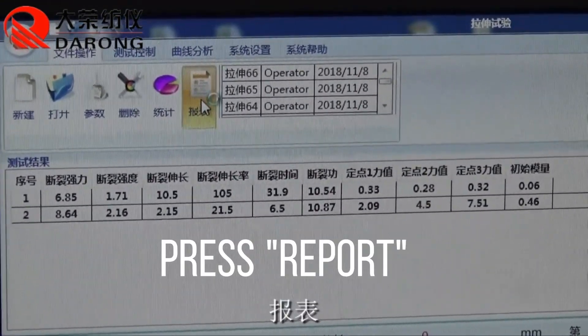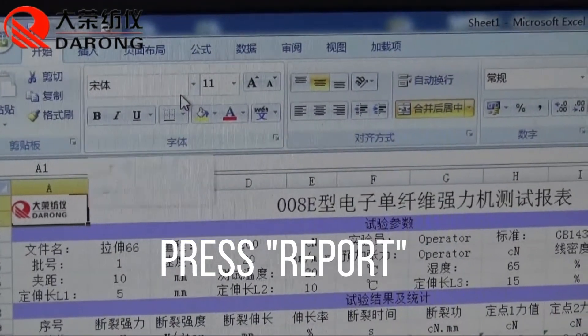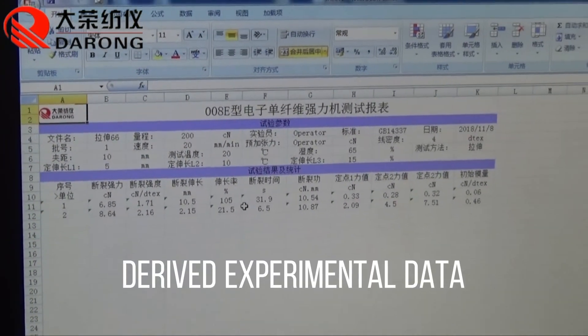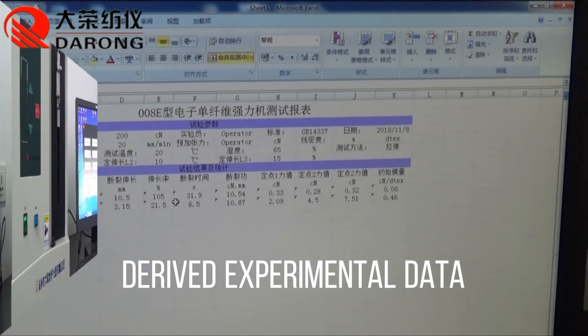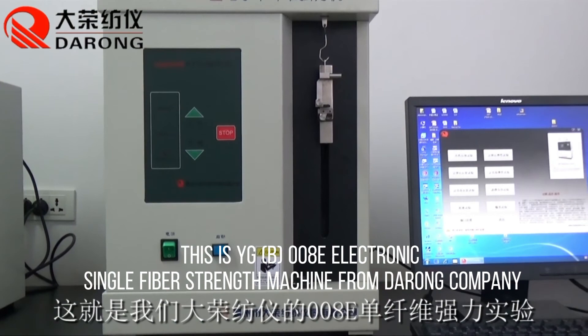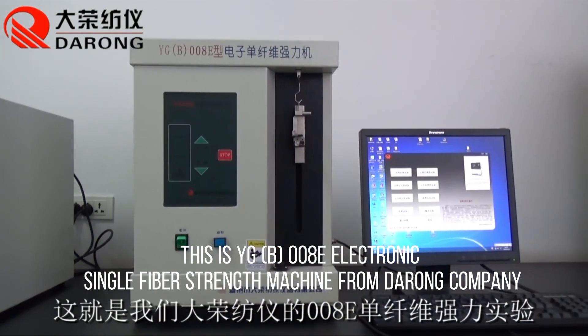Press Report to view the experimental data. This is the YG(B)008E electronic single-fiber strength machine from Darong Company.